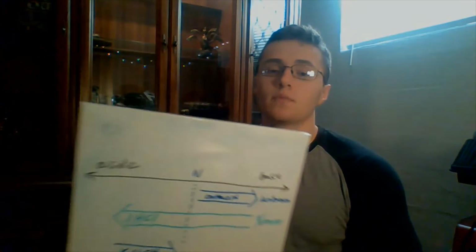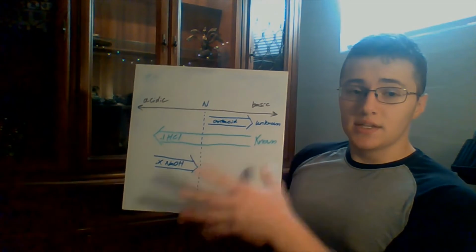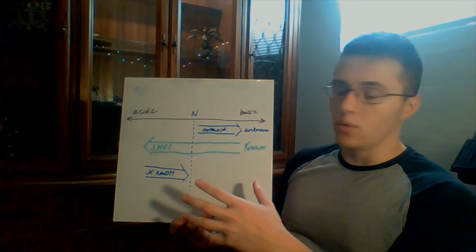Moving on to part 3, where we actually get into the back titration part, and this is where our antacid comes in. I'm going to show you this graph that you should have been given in your books, but I'm going to go ahead and explain it in some greater detail just because it's more important for you to know. So I'm going to sit over here because I got extra space. This is our sort of diagram of what we're going to be working with.